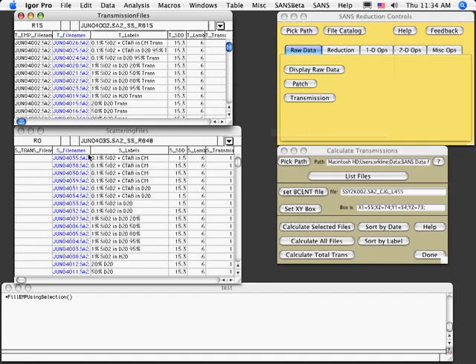The next step is simply to assign the correspondence between the transmission file names and the scattering file names. In this case, run 26 is 0.1% silica plus CTAB in a contrast matching solvent, which should match and should be pasted into the transmission file names of the first 4 runs here, 35, 38, 30, and 39. This would normally be done by cutting and pasting.